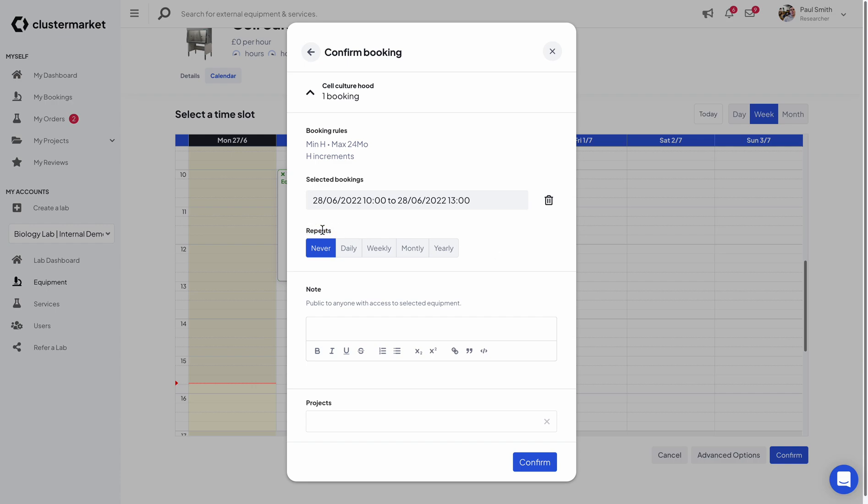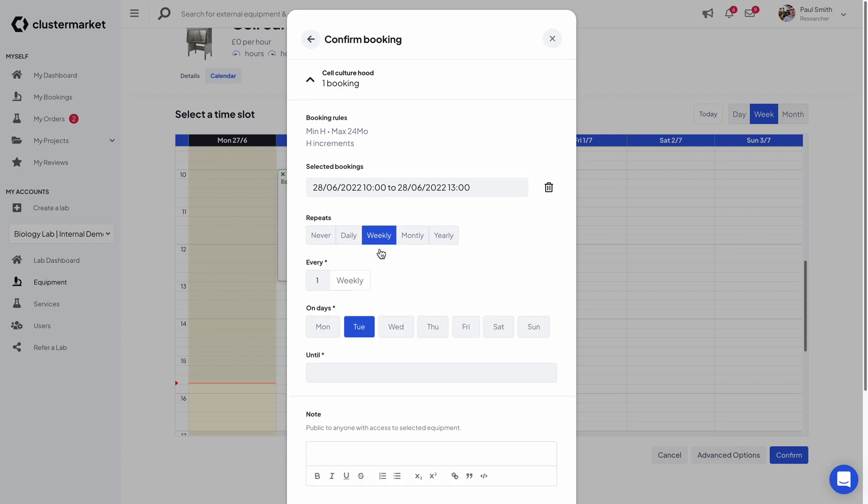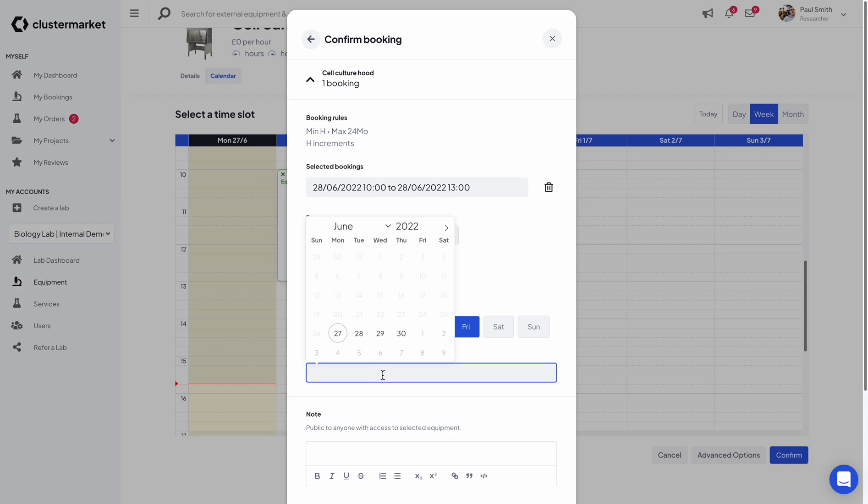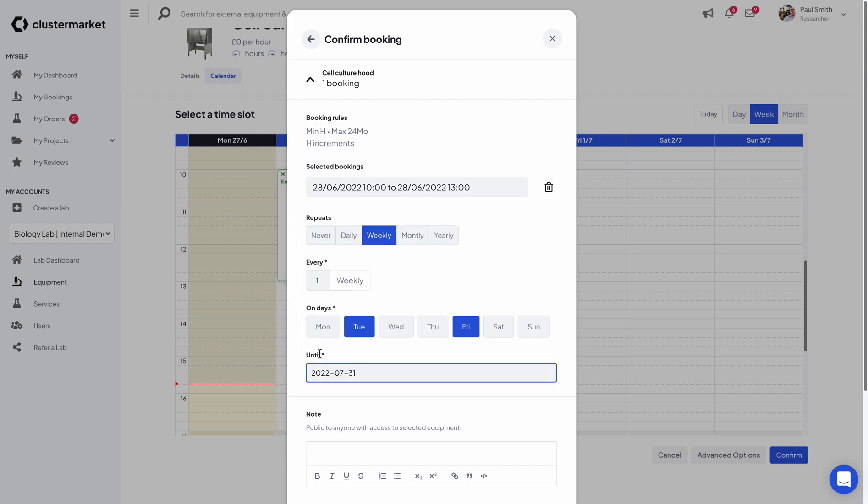So I'm going to say that this booking repeats weekly on Tuesdays and Fridays. And then as I need this booking to occur two times a week for the next five weeks, I'm just going to say that it will stop at the end of July.